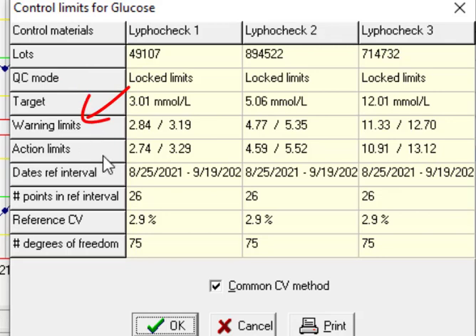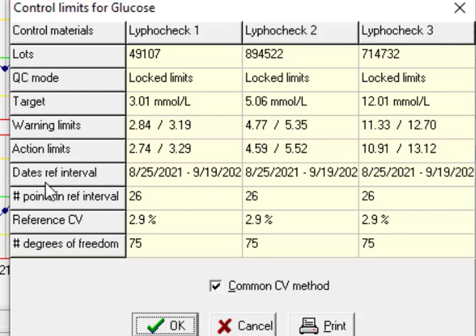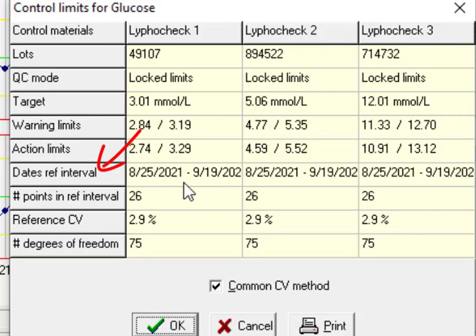Warning limit that is two standard deviation and action limit is for three standard deviation. This reference interval is the limit that we chose the data from and locked it in order to calculate these parameters.